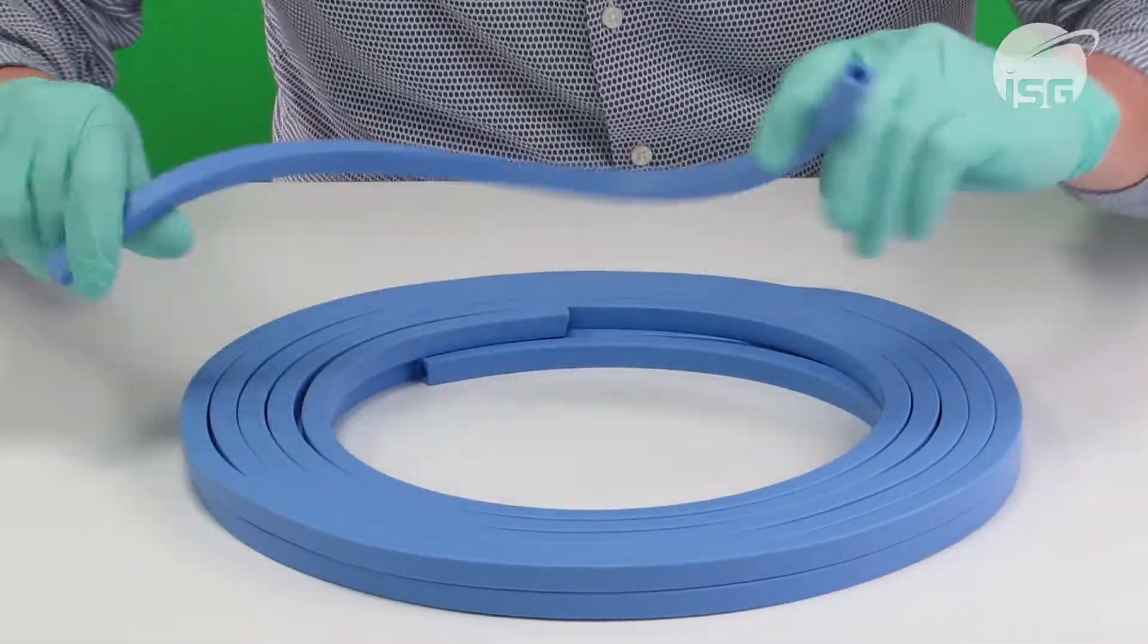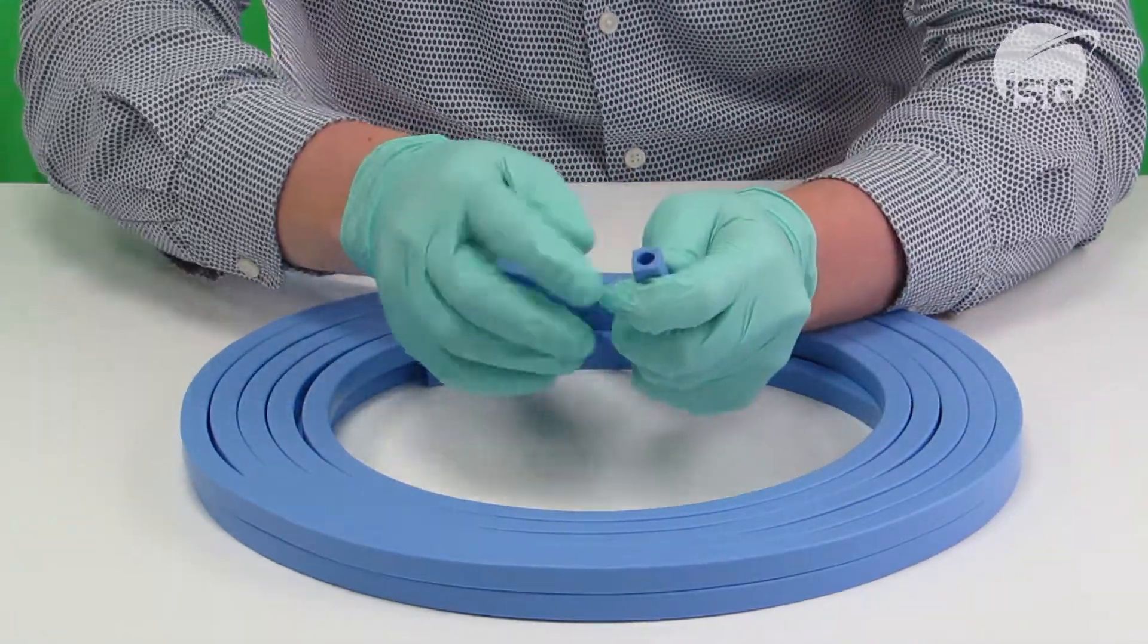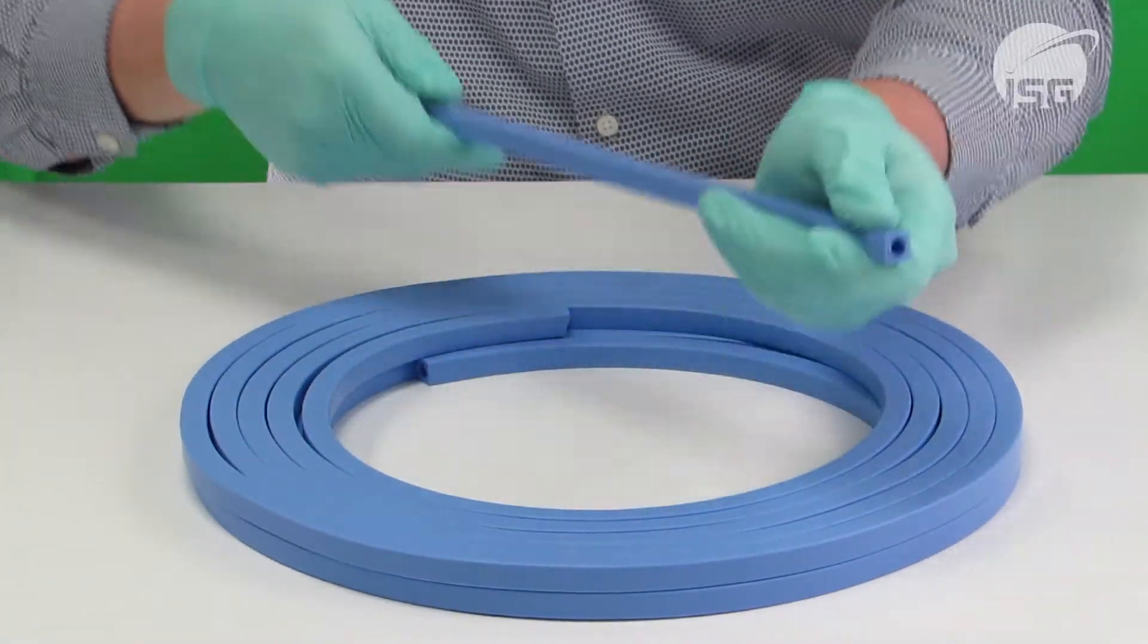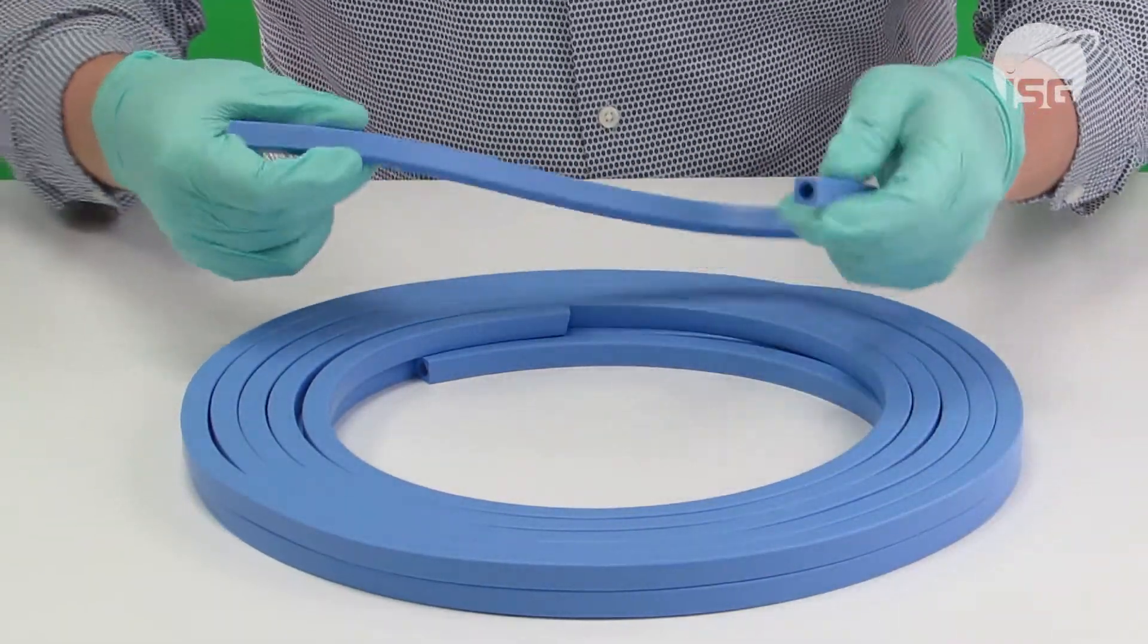The tubing has an 8mm bore which due to its flexibility can be stretched up to 12mm to cover most applications including laboratory taps, gas taps and Bunsen burners.